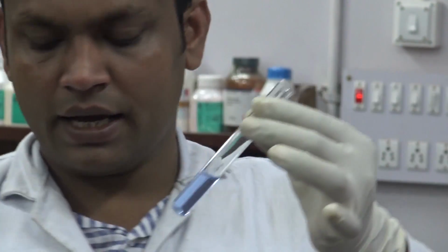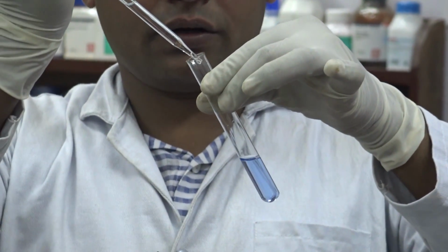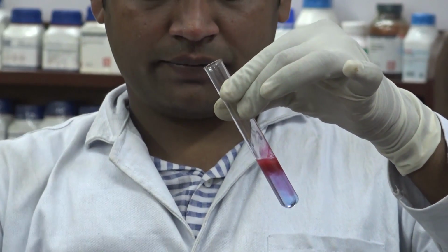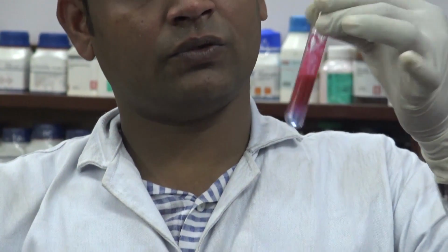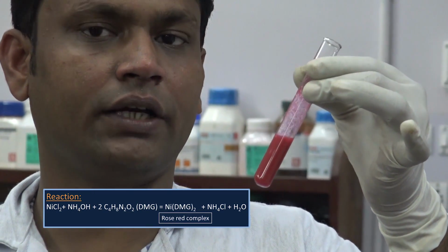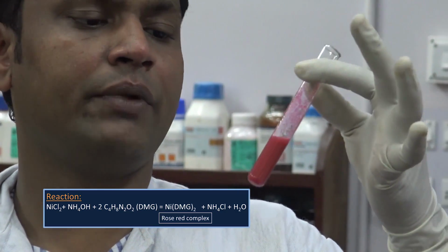After that, to this alkaline solution, add few drops of dimethyl glyoxime solution. Formation of rose red color or bright pink red color indicates the presence of nickel in our solution. This type of rose red color appears for nickel DMG complex.